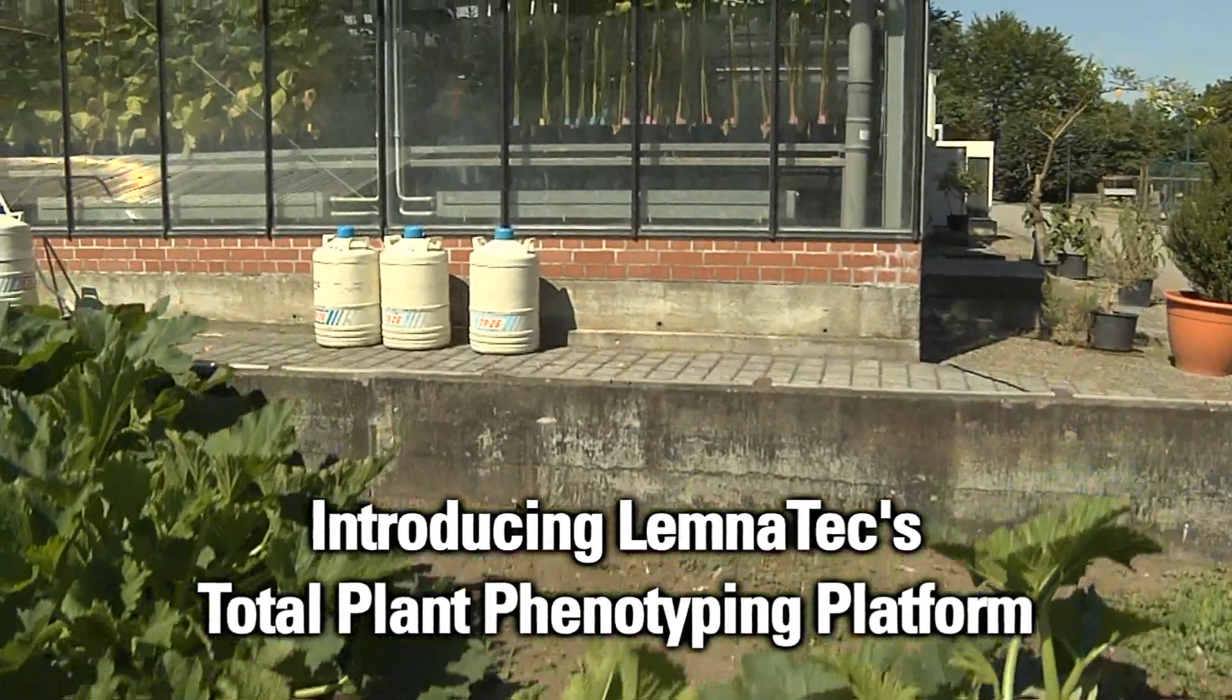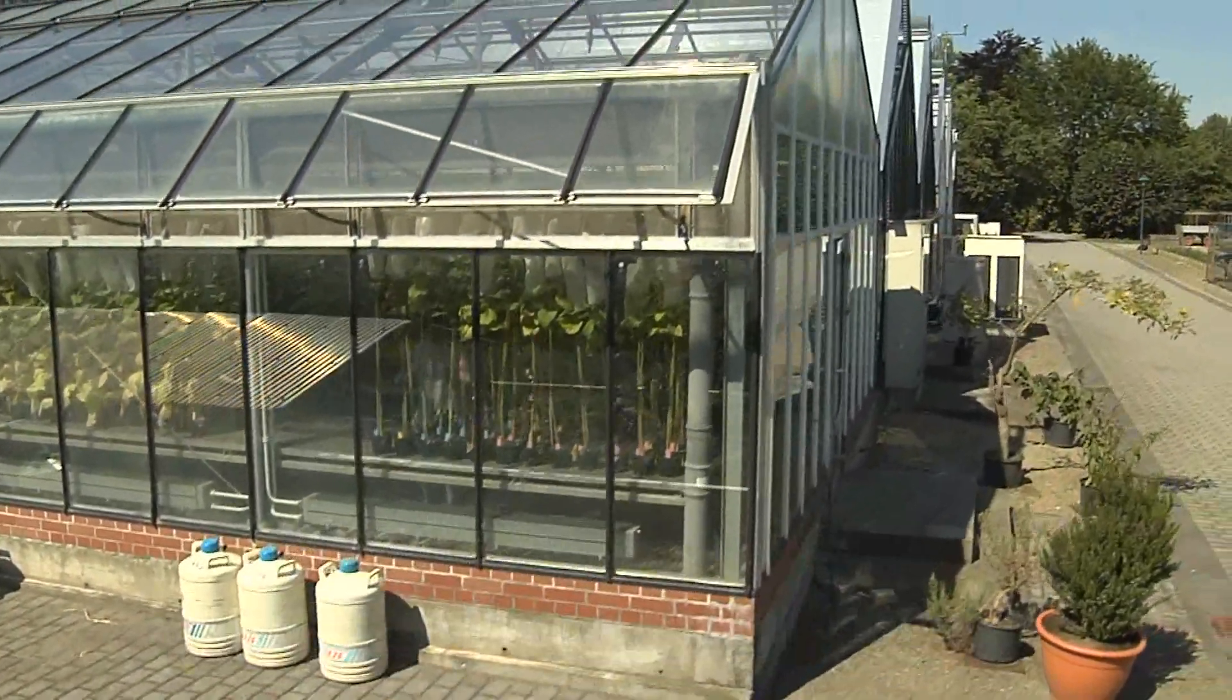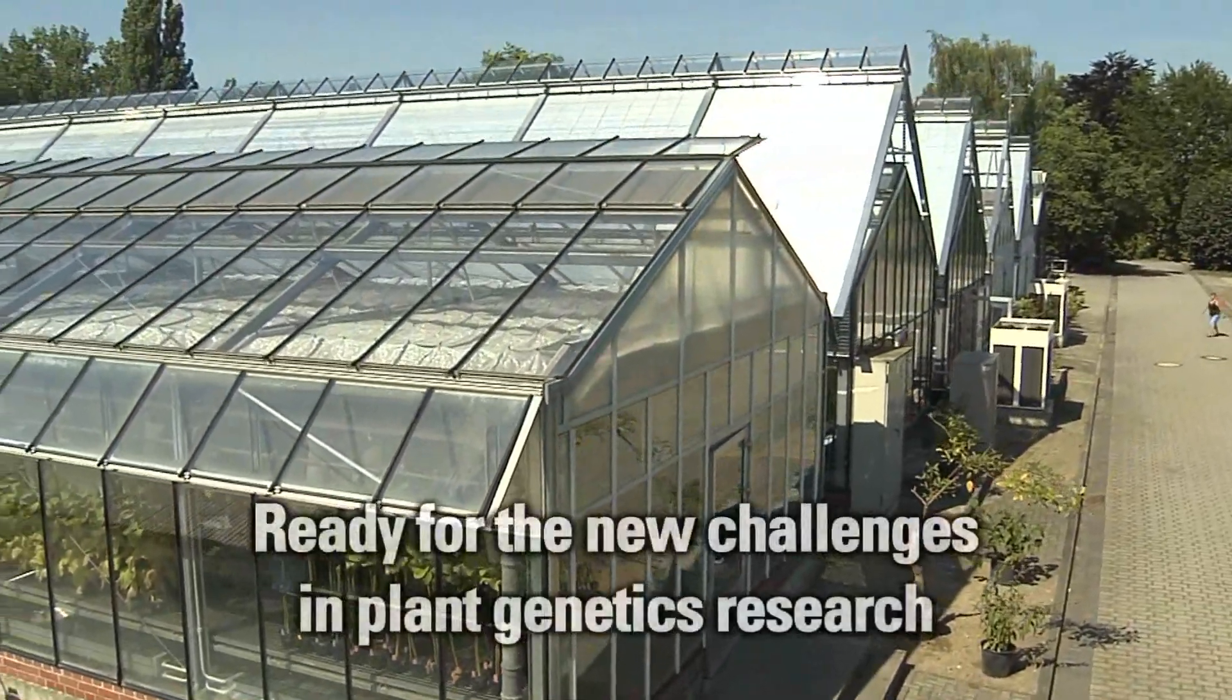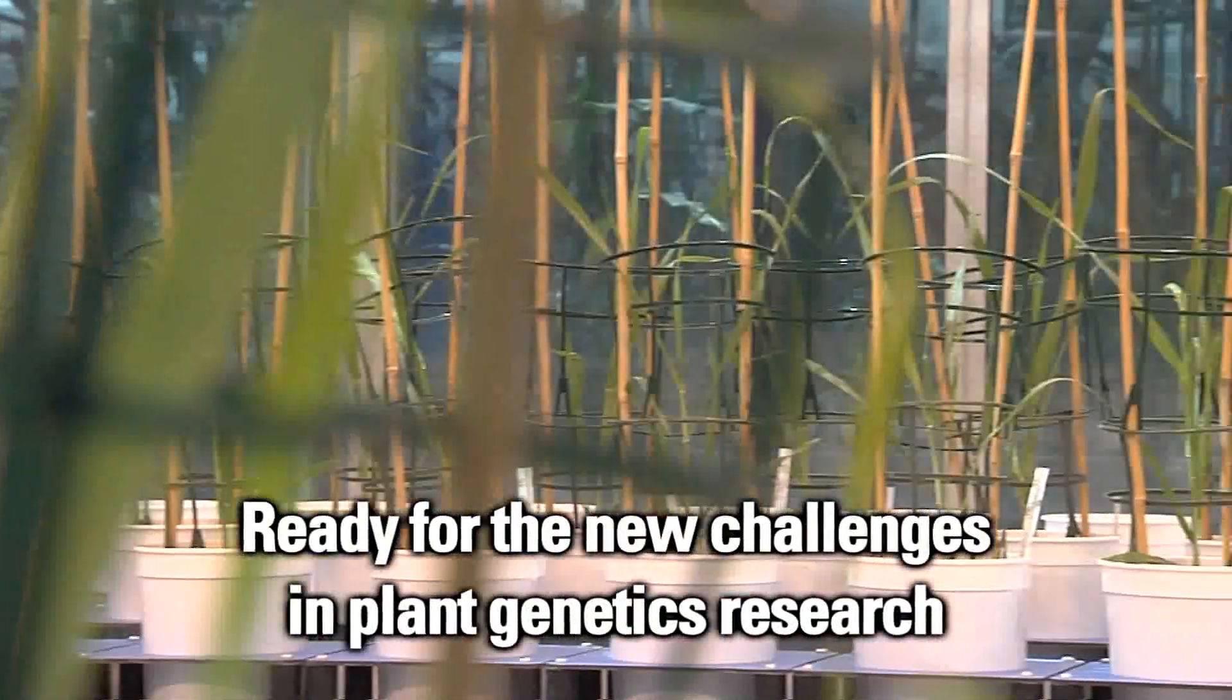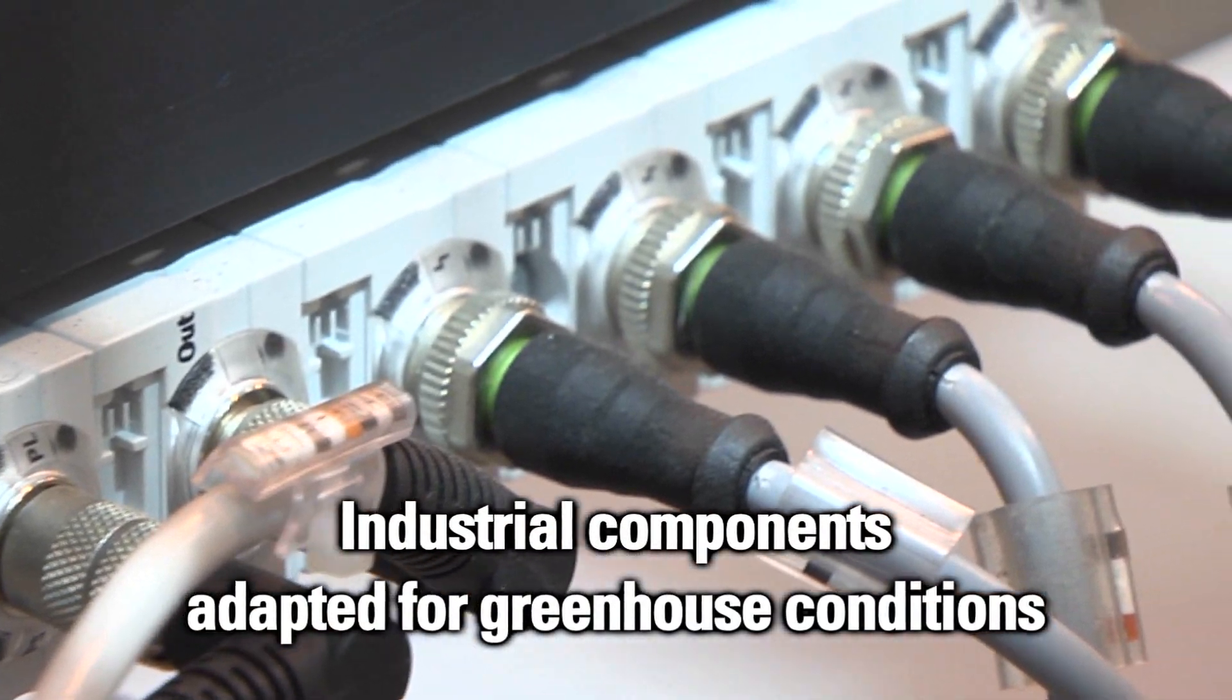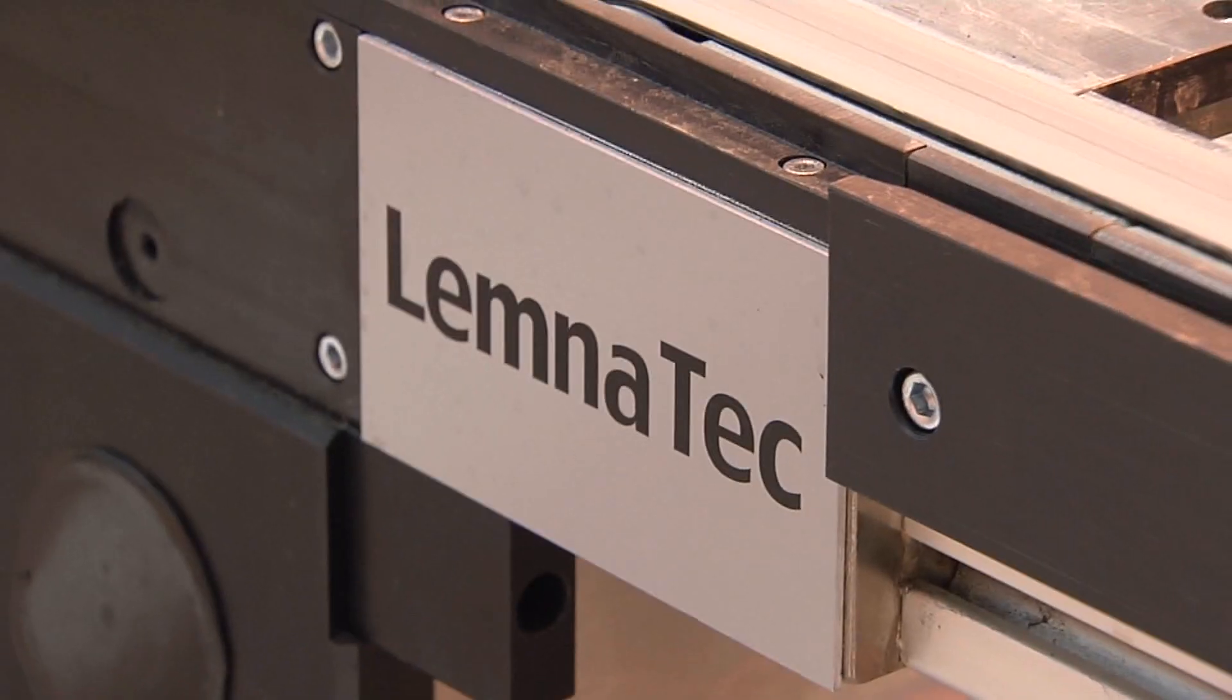Following the huge accomplishments in plant genetics, the subsequent challenge is the mapping of large populations for a better understanding of plant phenomics and integrated plant performance. Introducing the new high throughput and high content plant phenotyping platform, LemnaTec provides the technology to answer this new challenge.